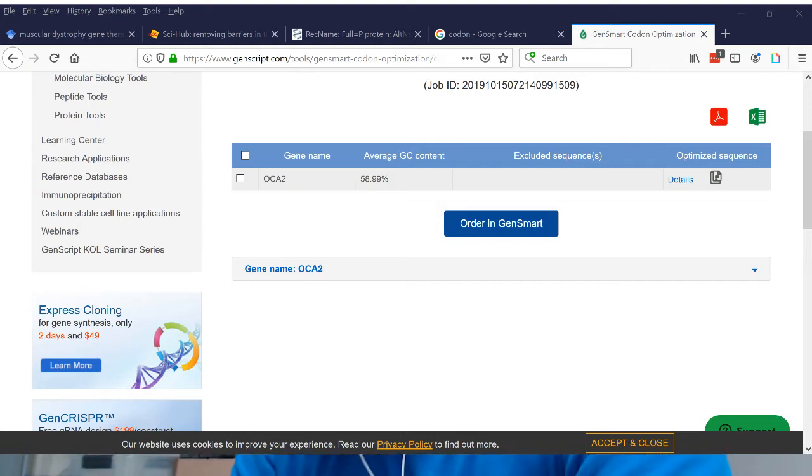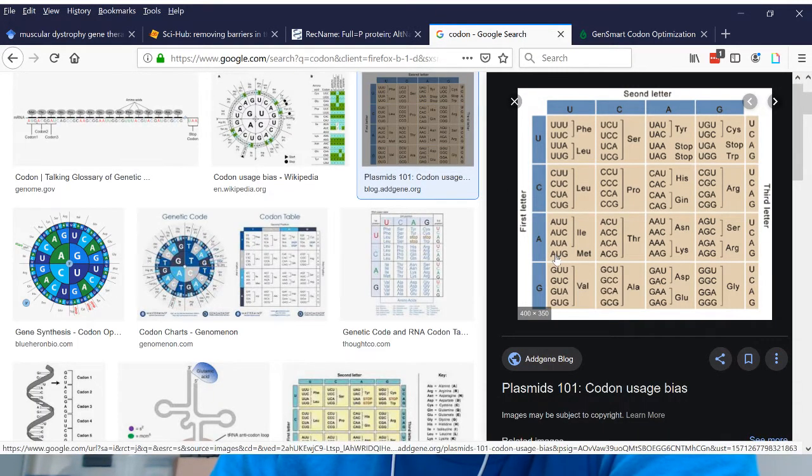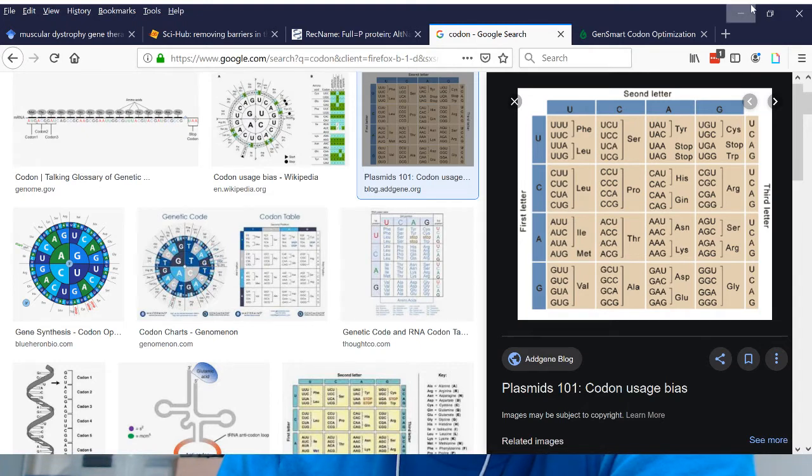Now, if you remember, we talked about it earlier. There's one thing that we don't have that we need to add, and that's the stop codon. So, TGA, that's a stop codon, right? TGA, yes. TAG and TAA. All right. So we added in the stop codon.